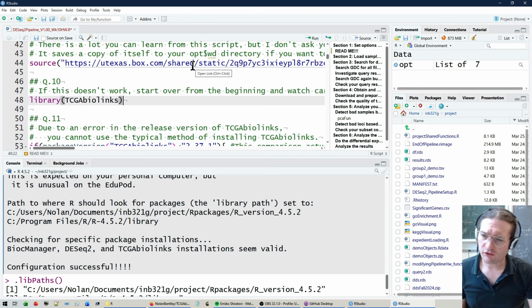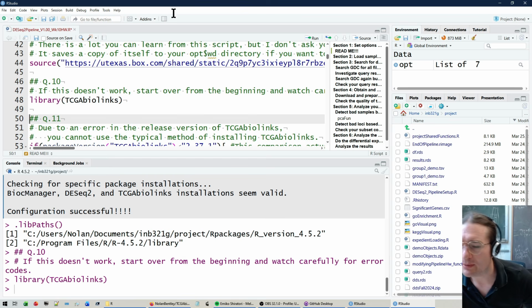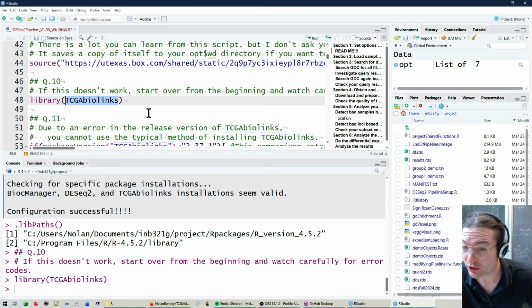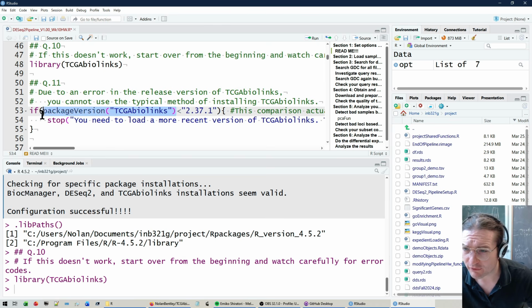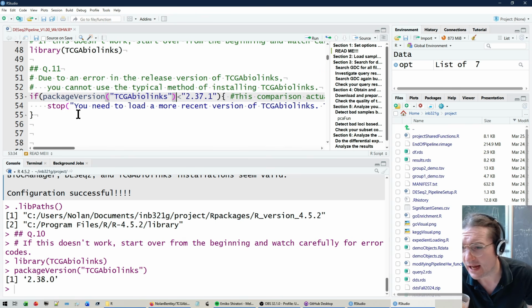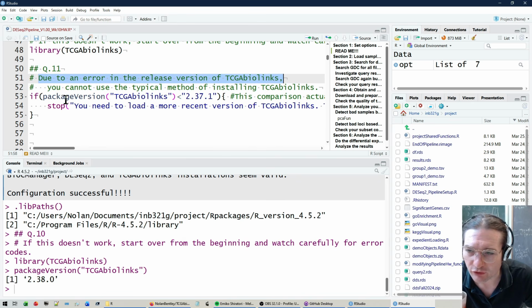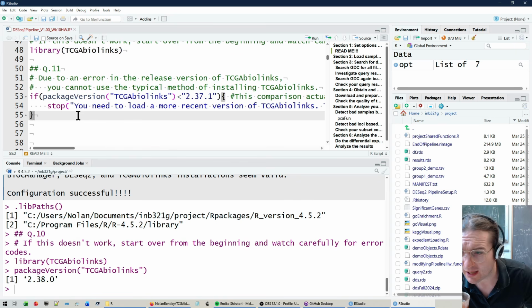So finally, it then checks to make sure the essential and really hard package to install is able to be loaded. This is in fact the package that's currently broken. Let's see what version I'm installing. So we're installing, well, not the worst version. Unfortunately, this one is still not working, and so this code, actually, in fact, this code might be what I change as I release the next version of this script file. Hopefully fixing it after I finish this video.